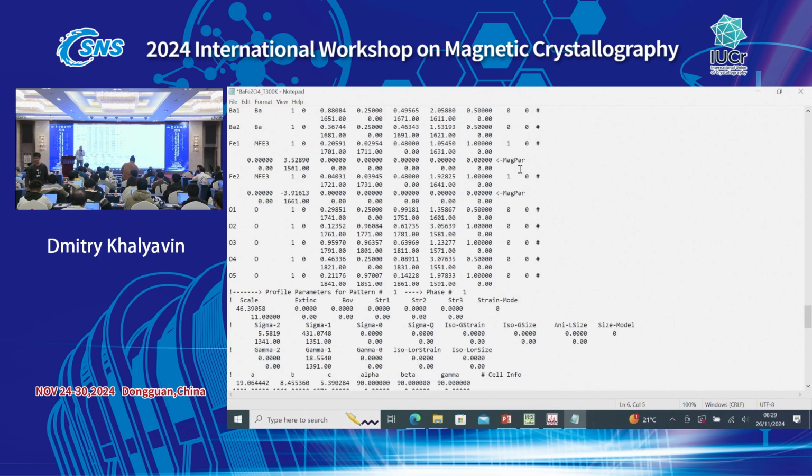Thank you. My question follows the previous one. I tried two magnetic space groups using the Bilbao server, with two k-vectors. So I get two magnetic phases, just like the one you used. If I put both of them in one PCR file, I think I will have two nuclear phases at the same time.